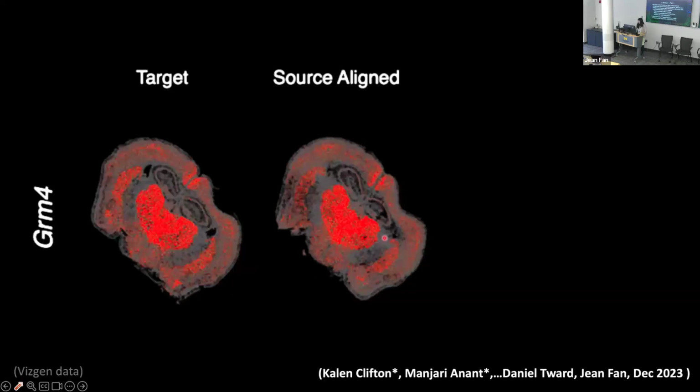Okay, so that's part one, but now that we have these aligned tissue sections, how can we further, let's say, quantify their similarity or agreement, or identify discrepancies and differences that might be indicative of some disease-specific process? So again, even though we've aligned them, there are, let's say, differing numbers of cells across these two tissue sections.